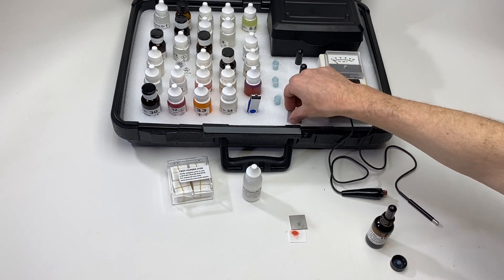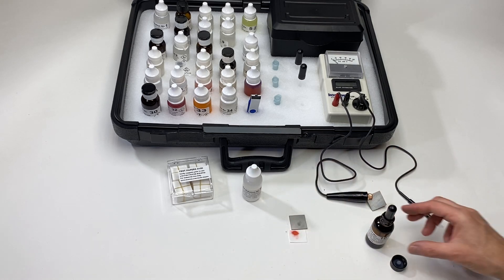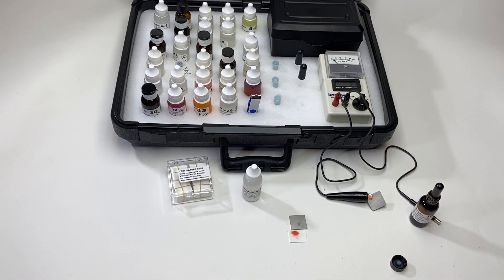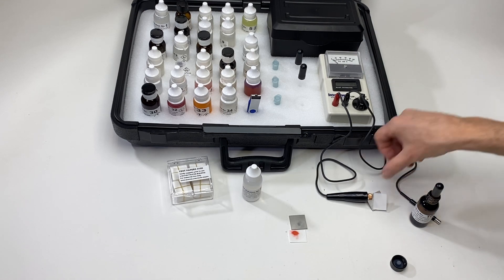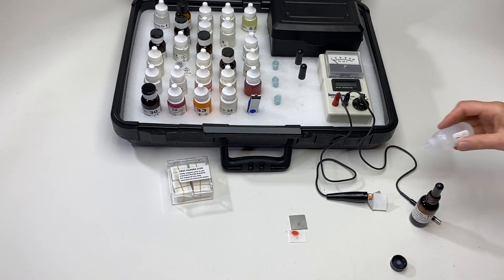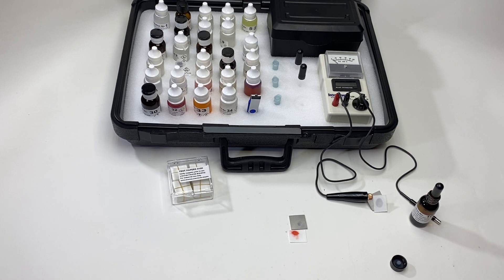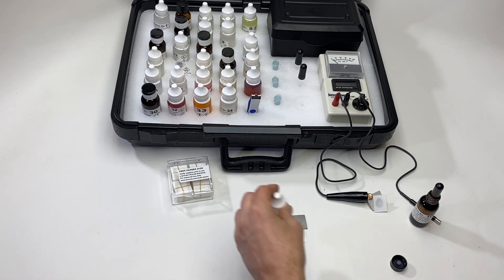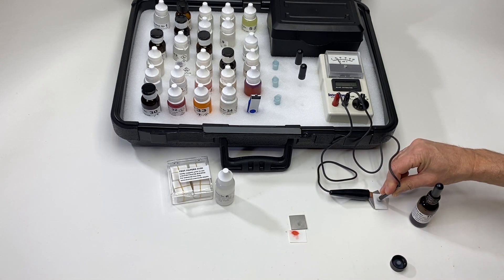Let's try another sample. Attach the alligator clip, add the 0100 test paper, a drop of solution 6, and we'll do the same thing again — 10 seconds. I'm just going to watch the timer go up to the number 20.